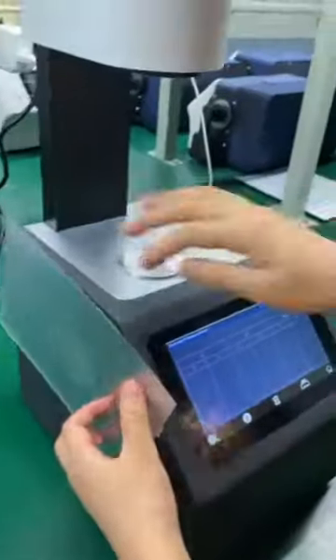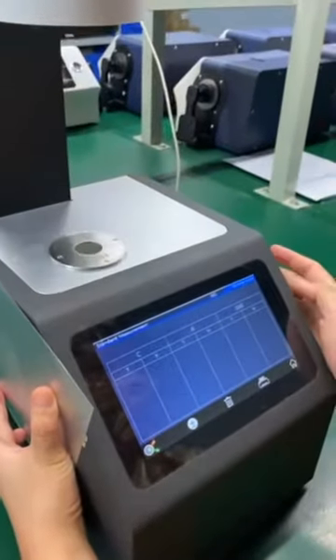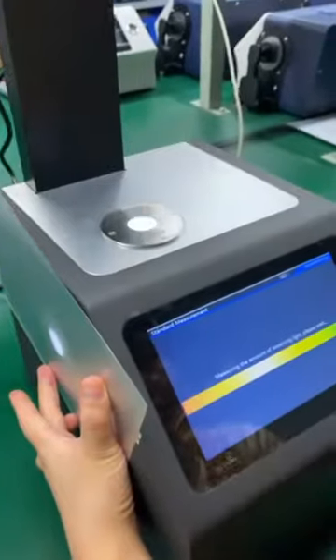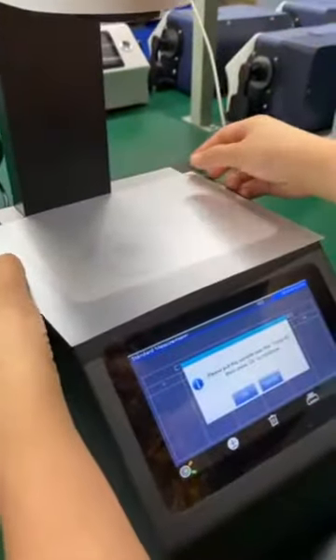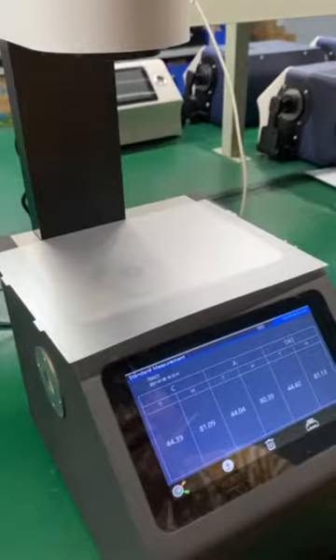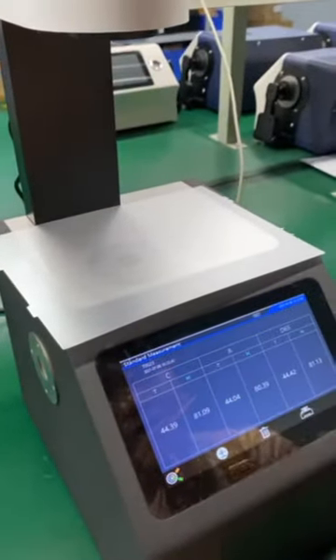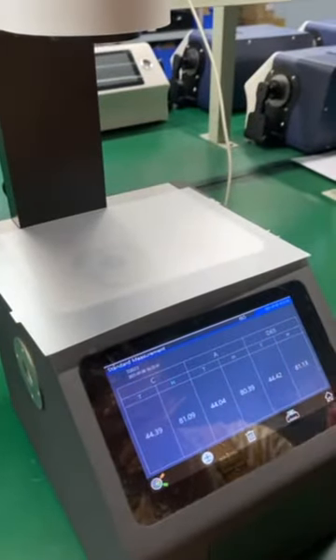First, we put the sample in the compensation aperture. Measure it. And then we put the sample in the zero calibration aperture. Okay. Now we get the transmission value and the haze value. Here are C, A, and D65 light source.